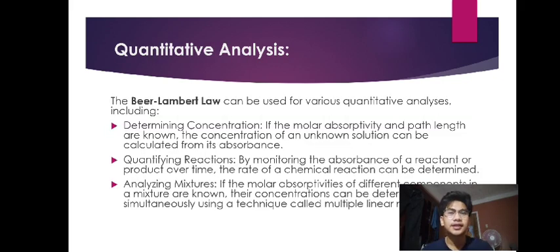The path length is the distance the light travels through the solution. It is typically measured in centimeters.